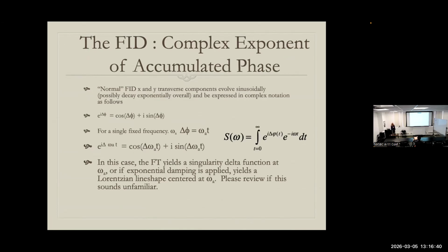Now, we have an FID. That thing that I just drew was the FID of a particular crystal, assumed to be uniaxial, during moderate MAS frequency. That was an FID. So we know how to get a spectrum from an FID, right? I give you an FID, you can give me a spectrum. And you can do that in reverse: I give you a spectrum, you can give me back the FID.